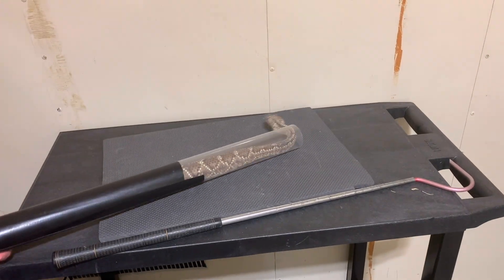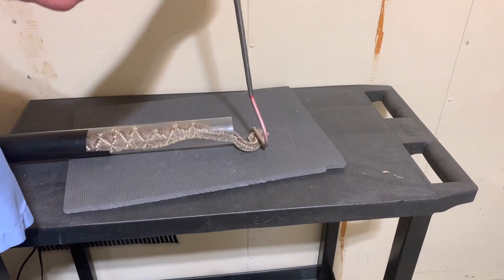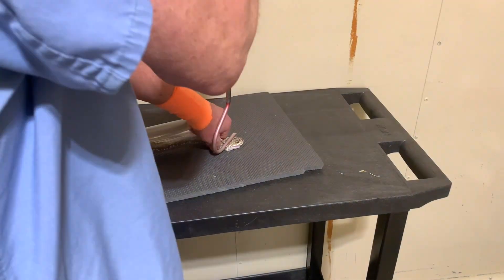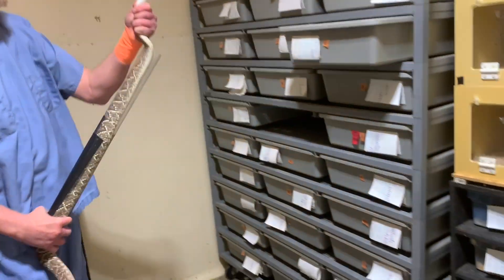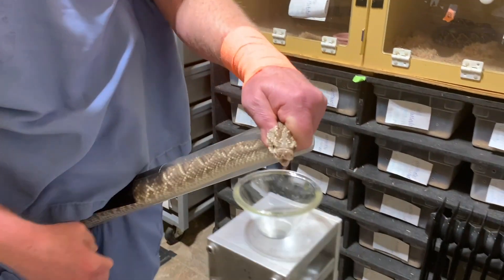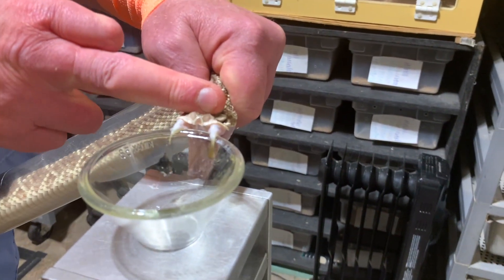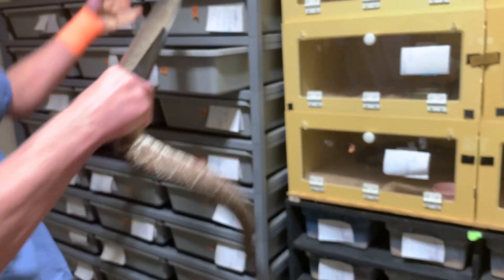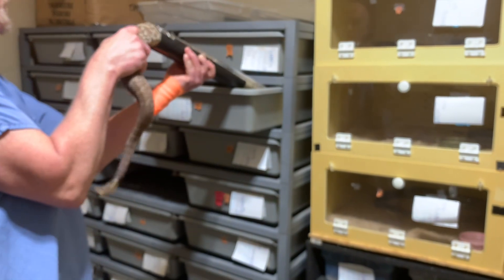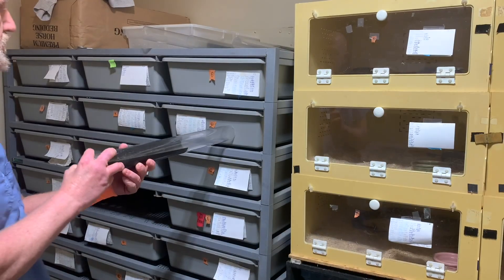These snakes go through this stressful experience, and it is similar to what they would encounter in the wild — they would be scared if a predator got hold of them and felt they had to bite to defend themselves. The rest of their life we try to make as stress-free and easy as possible, so they can tolerate these few minutes of higher stress, which is about once a month for these guys.